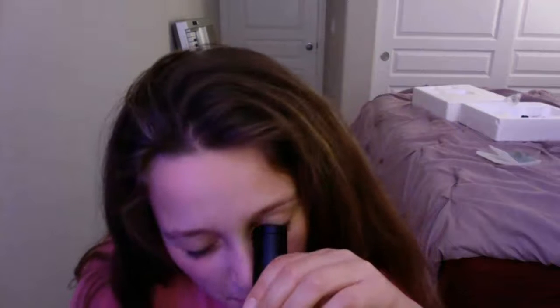It kind of looks like the skin. Whoa — it's like the skin! The skin was from right here, and the nail was from the same spot on the edge of it. I'll put pictures on the screen so you guys can see what everything looks like. That is something very weird.